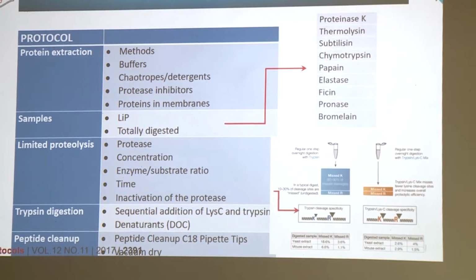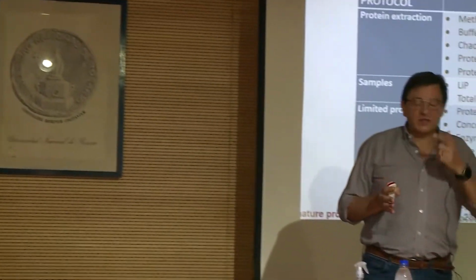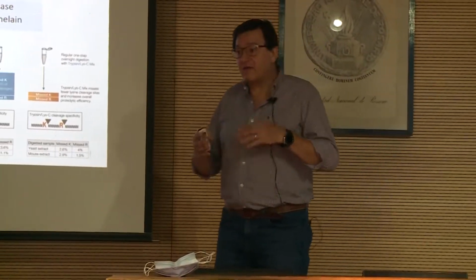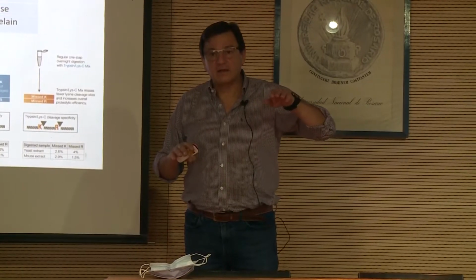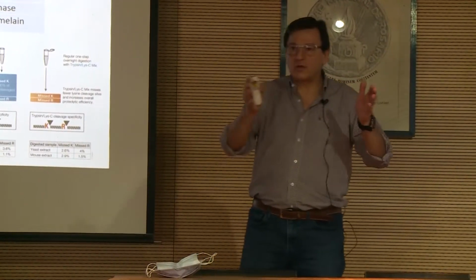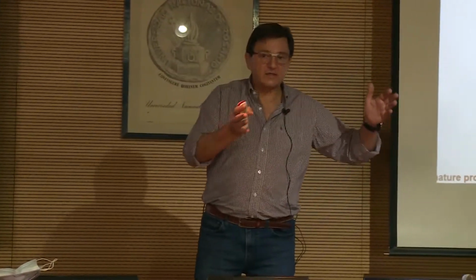In these experiments, it's important to be sure that you have a full digestion. Because one of the problems is that we are trying to identify peptides that maybe are not the most important peptides of our study. Because maybe the complex is only a fraction, and then of this complex only a fraction is digested by the protease.